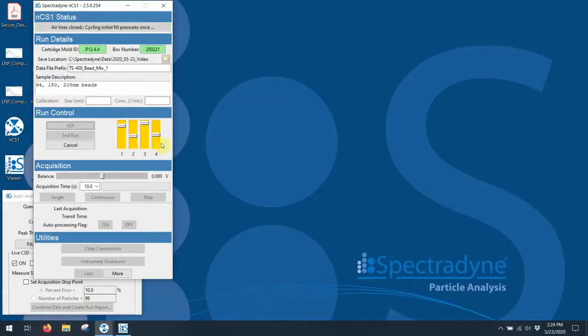The fill monitors shown here are monitoring the state of the fluids inside of the cartridge. As these turn green, they're indicating that the cartridge is ready and you can now begin the actual measurement.